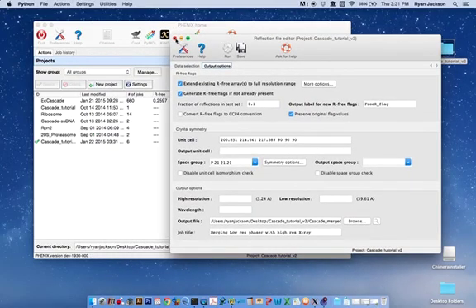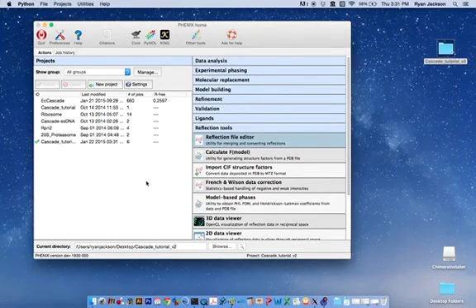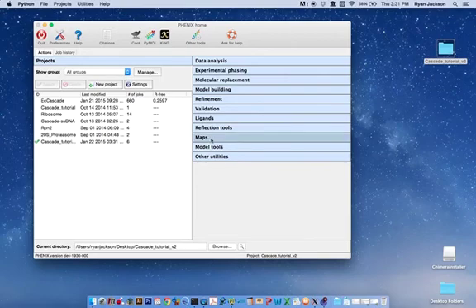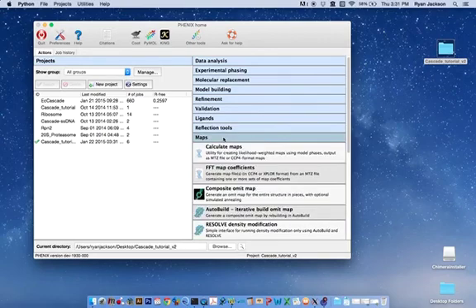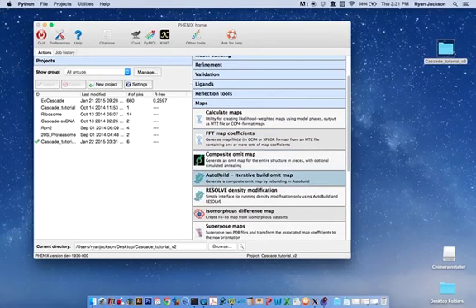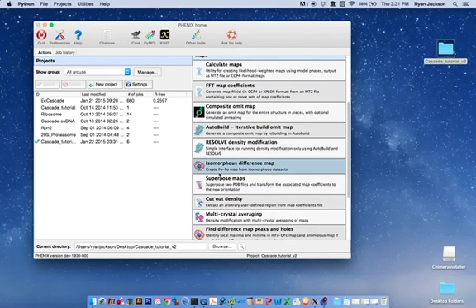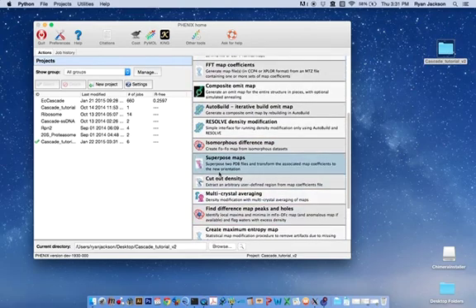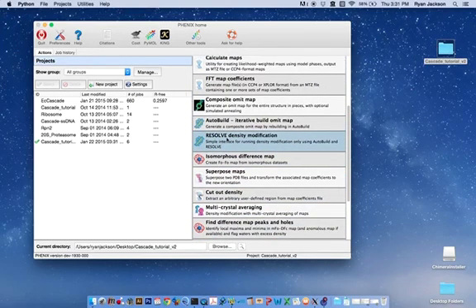Now we're going to use this merged file in Resolve, the program Resolve, to extend the phases into high-resolution. We go to Maps in the Phoenix GUI and go to Resolve Density Modification Tool.